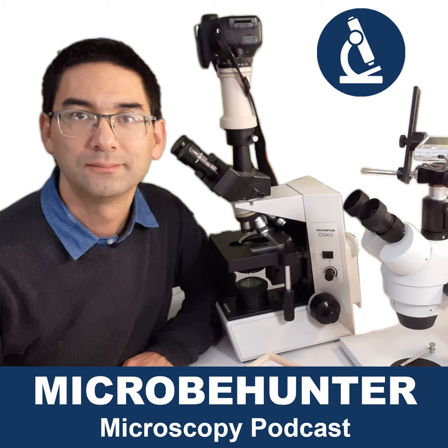If you magnify very much, like 400 times or even more, then the water organisms that move around move out of the field of view so quickly that you lose them, and then it's very difficult to chase them.